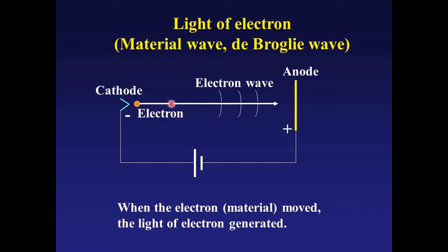Okay, electron momentum, the traveling electron, and wave generation, both phenomena simultaneously exist. Do not confuse. The electron never changes to a wave. The electron still exists and can arrive at the anode with momentum. Simultaneously, an electron wave is generated. We can apply this electron wave for electron diffraction, electron wave optics, and image forming. And also simultaneously, this electron momentum can excite the specimen. We can observe the X-ray excited from the specimen or the electron energy loss spectrum from this specimen. We can observe the wave image, the morphological image, and also specimen information simultaneously.